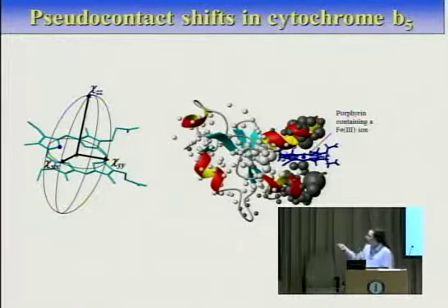And actually, the directions in which this susceptibility anisotropy is diagonal are not random, but they are determined by the coordination environment of the metal ion. So there's some inorganic physical chemistry going on here, which we don't care much about today.